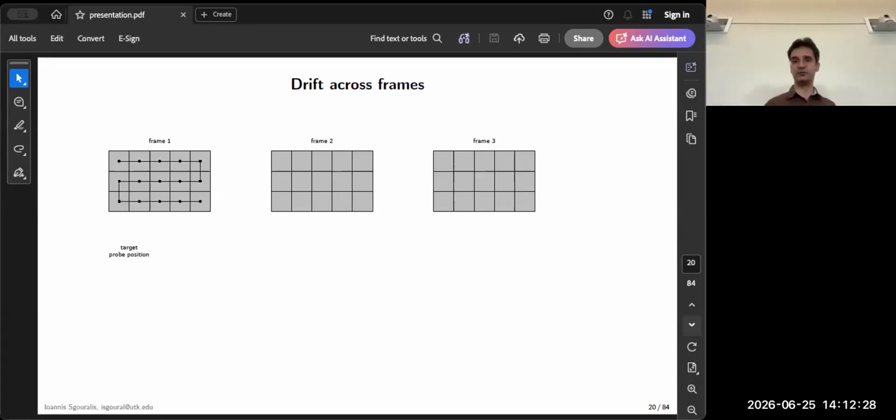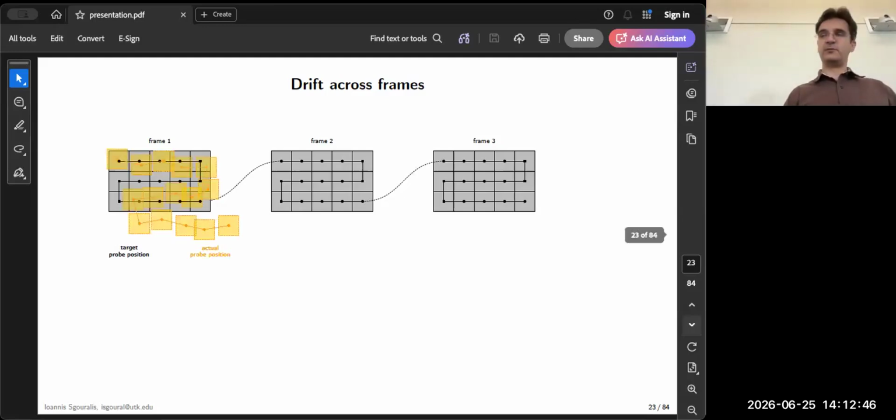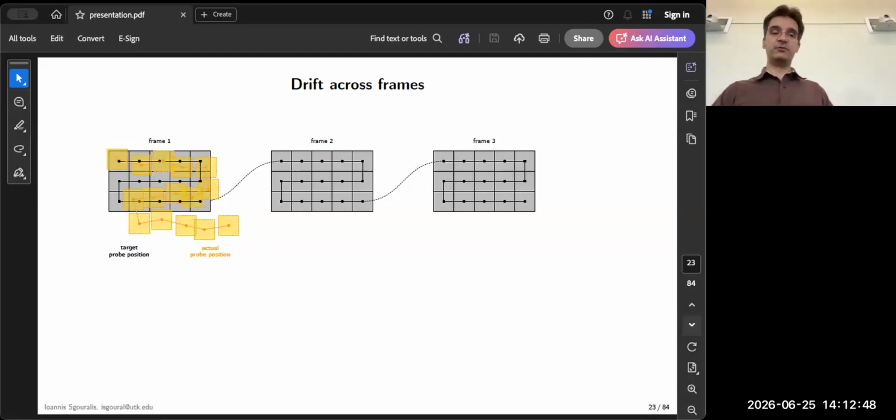The first image is going to be scanned, and at the end of the first image, the probe is going to move to the beginning. Let's say it scans the pixels again in the same order for the second frame. Once the second frame is fully acquired, it's going to move to the third frame, and so on. So now, as I have already explained, each frame is slightly distorted because we have a slight error that is accumulated within the acquisition of each frame.